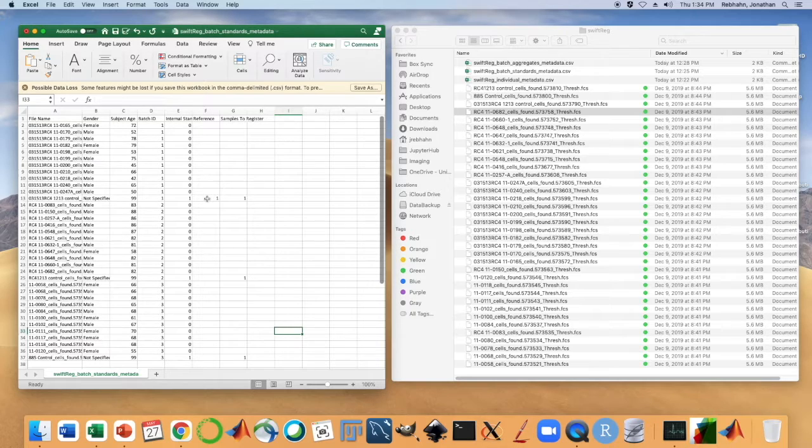And it will create a batch shift template for each of these samples that are registered. The batch shift template will then be applied to the individual samples. So we want to also tell it the samples that we want to shift. And in this case, we want all of the samples. So that is all we need to do to set up our batch registration metadata file.